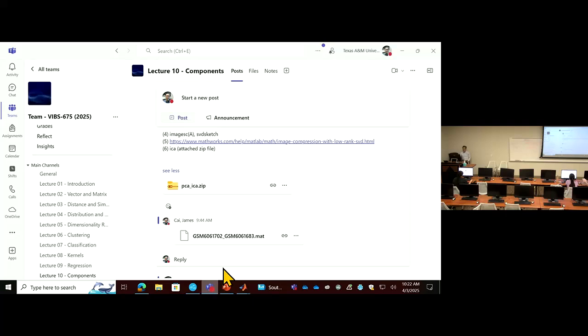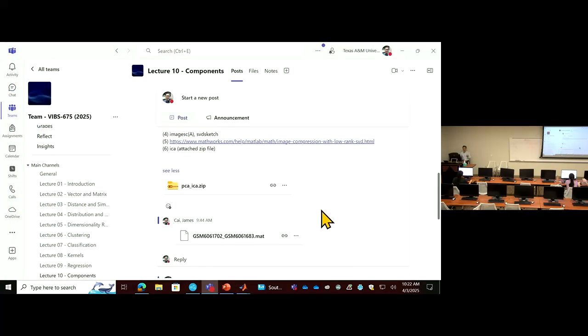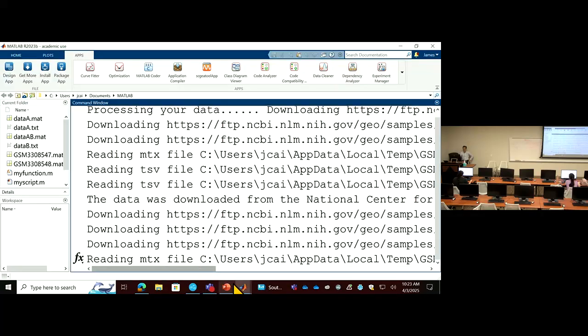If you don't want to wait, or your computer is constantly giving you error messages, you should be able to download this processed sample, save it into your hard drive somewhere, maybe the download folder, and then come back to this dialog window and choose import a MAT file, which is the first option in the menu. You should have that processed data.